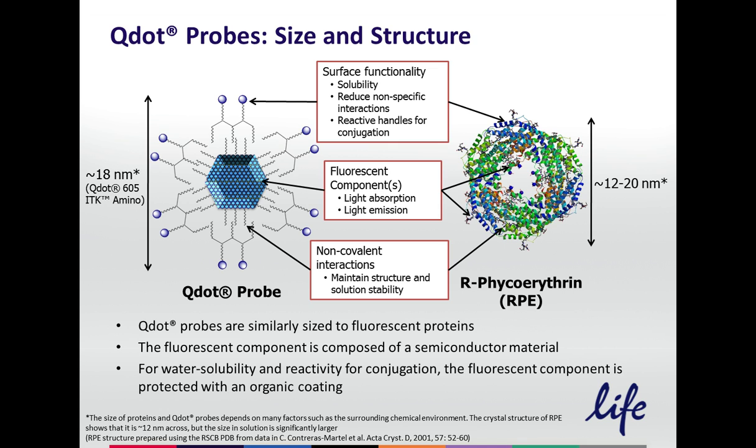It looks like a starry sky, a bunch of Q dots blinking at different rates all over the place. It's not usually an issue because the exposure time that you typically use is long enough that it encompasses the blink rate. But there are instances where the blink rate may be slow enough that it can cause a bit of a problem.